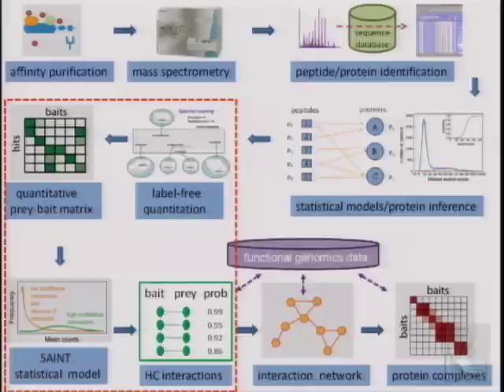So I'll talk about this part now in the remainder of the presentation, and maybe one minute on this part here. So I talked to you about how we collect data and hopefully arrive at a list of proteins and confidence scores so that we can filter that list efficiently with good discrimination, meaning we can eliminate false positives well. And also we have posterior probabilities calculated for each protein, as well as the global false discovery rates estimated. So what do we do next?